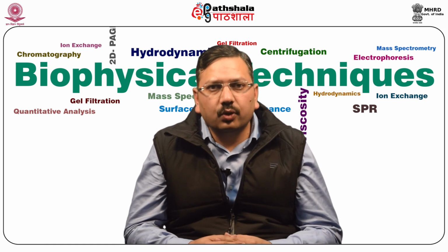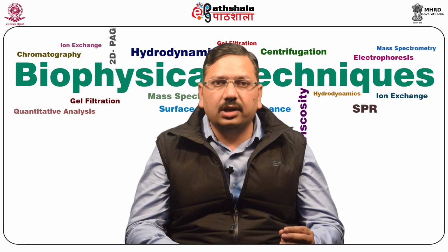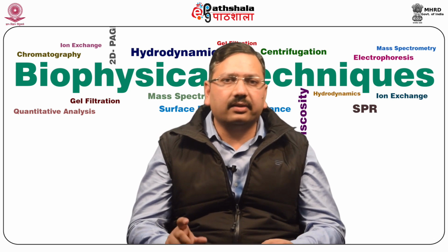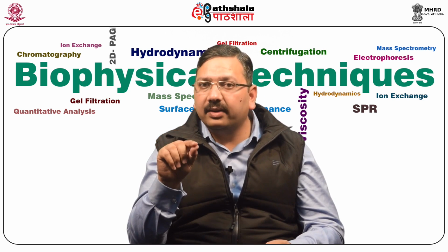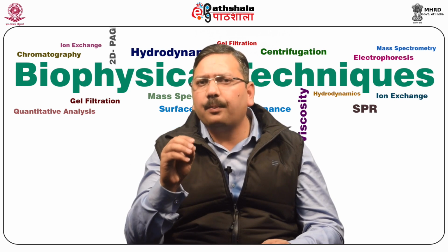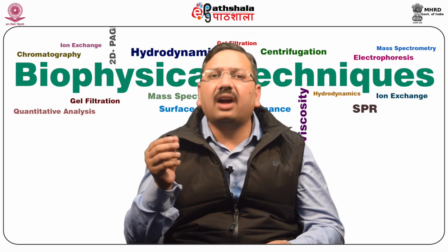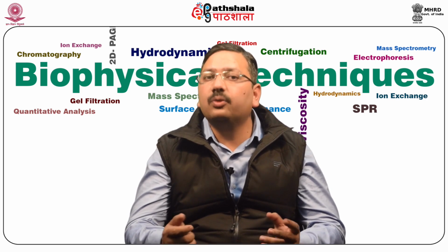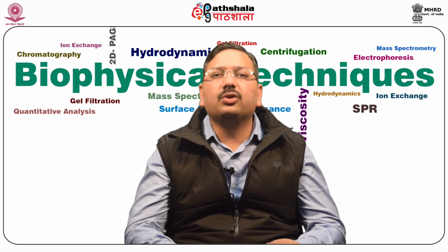So before going to start, I want to ask one question. What is mass spectrometry? Actually, mass spectrometry is an analytical technique that can identify a substance, its chemical nature and quantity present in a sample by measuring its mass to charge ratio. Mass spectrometry can identify compounds on the basis of the atomic composition of the molecules and their charge state. By mass spectrometry, blind analysis of an unknown sample is possible since mass spectrometry does not require comprehensive prior information of the sample.